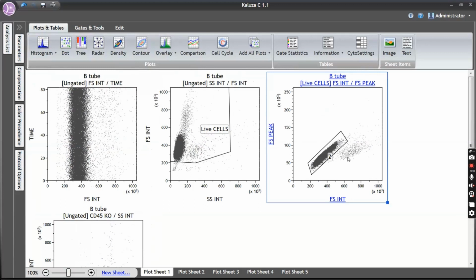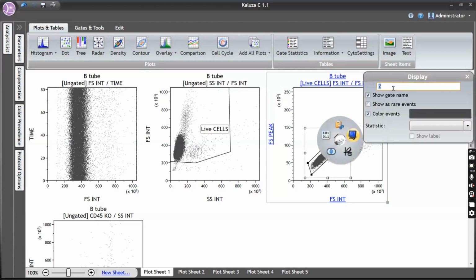And the other population is doublets, where two cells are stuck together and have crossed the laser beam together. I'm not interested in this population because the fundamental of flow cytometry is that one cell has to be analyzed at a time. So I've selected only the singlets because doublets have more area compared to singlets. Correct? That is why I'm eliminating doublets and selecting only the singlets. Clear? Yes, sir. Perfect.